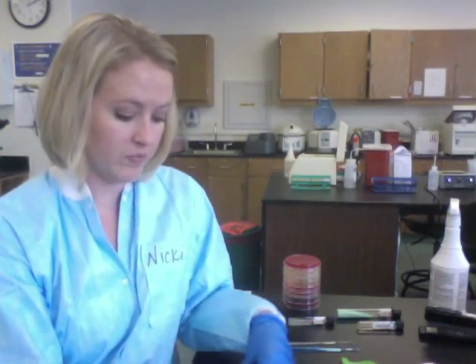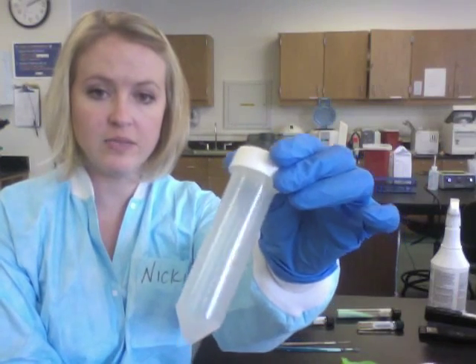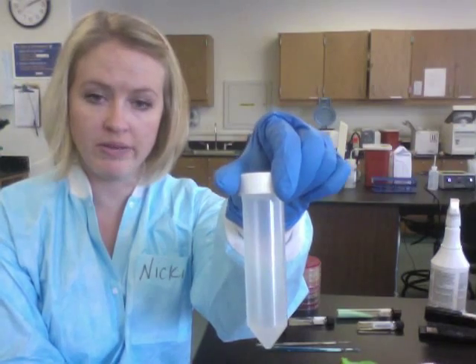When you open this package, open it up very carefully so the contents don't spill out and can remain sterile. You're going to take out the conical tube — it looks just like this, but it is not labeled, so you need to put a patient label on it.